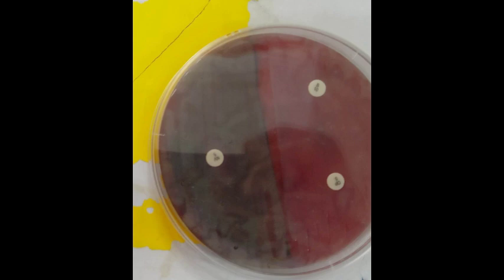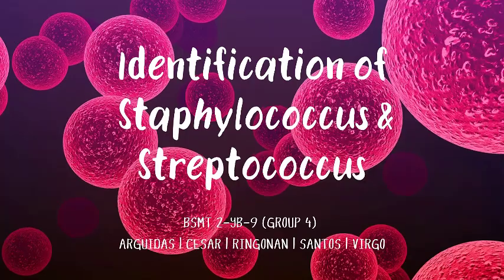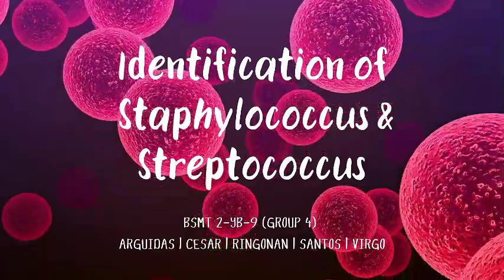To further identify which Streptococcus organism is being tested, we could perform additional tests such as the CAMP test, the PYR test, and other streptococcal biochemical tests. And that's it. Thank you for listening and watching.